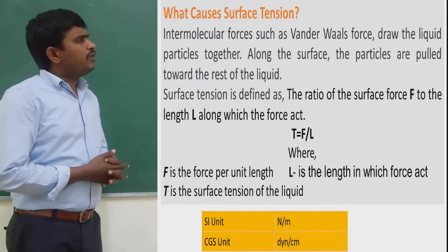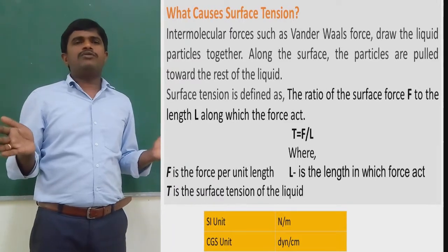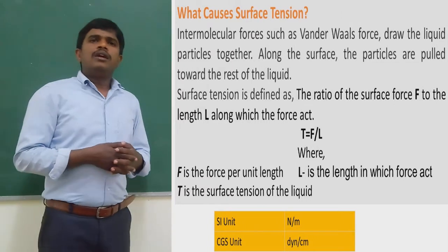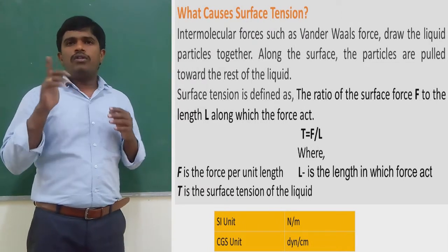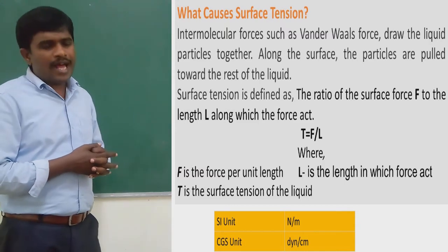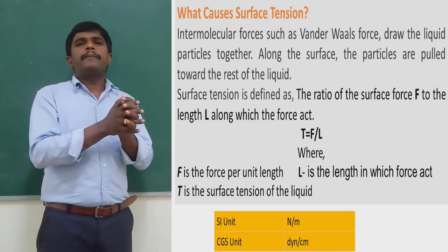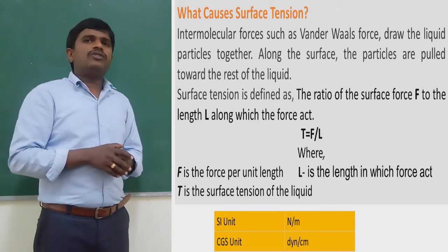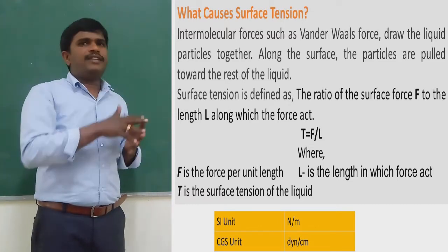So here, what causes the surface tension? That is the question that arises. See, intermolecular forces such as van der Waals forces drag the liquid particles together along the surface. The particles are pulled toward the rest of the liquid.